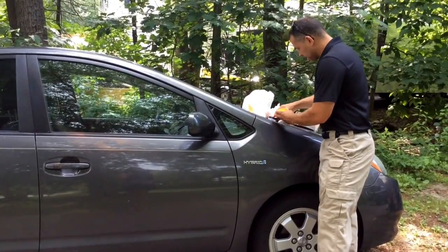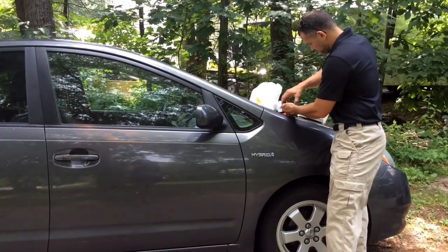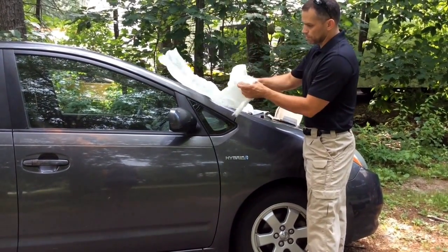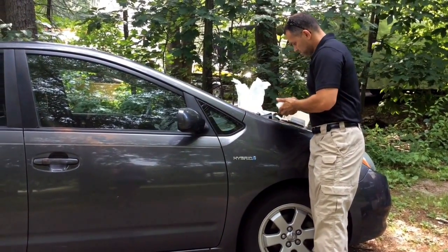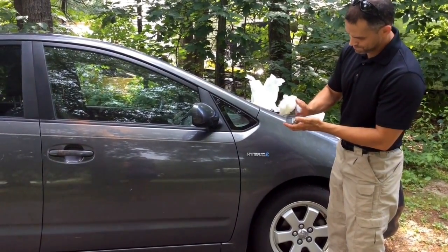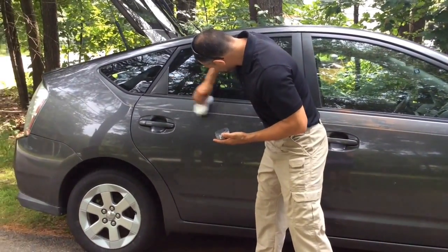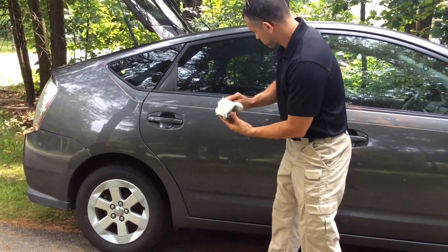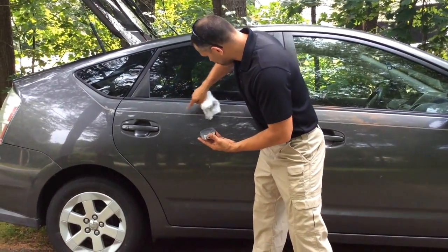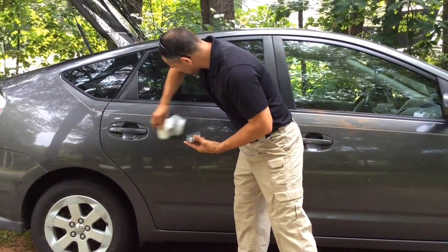Now I'm going to switch colors just to show the contrast. Now I'll use a gray powder. Same thing — I'm going to rip a piece of cotton and just go ahead and dust. You can see some beautiful fingerprints showing up on our door.